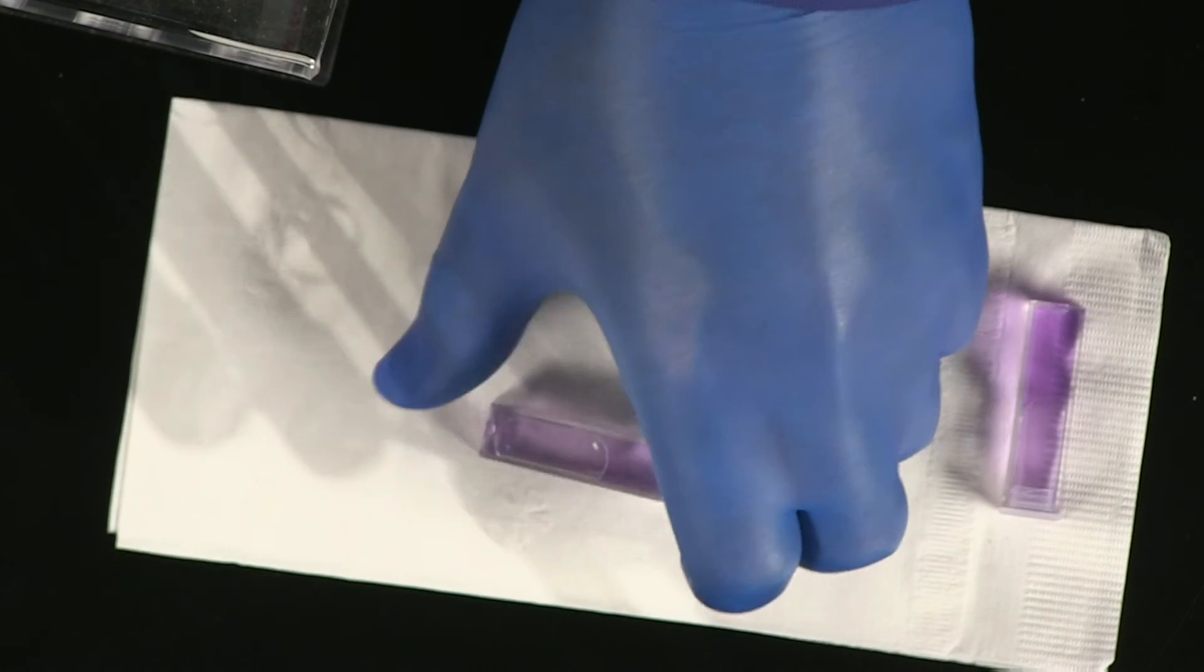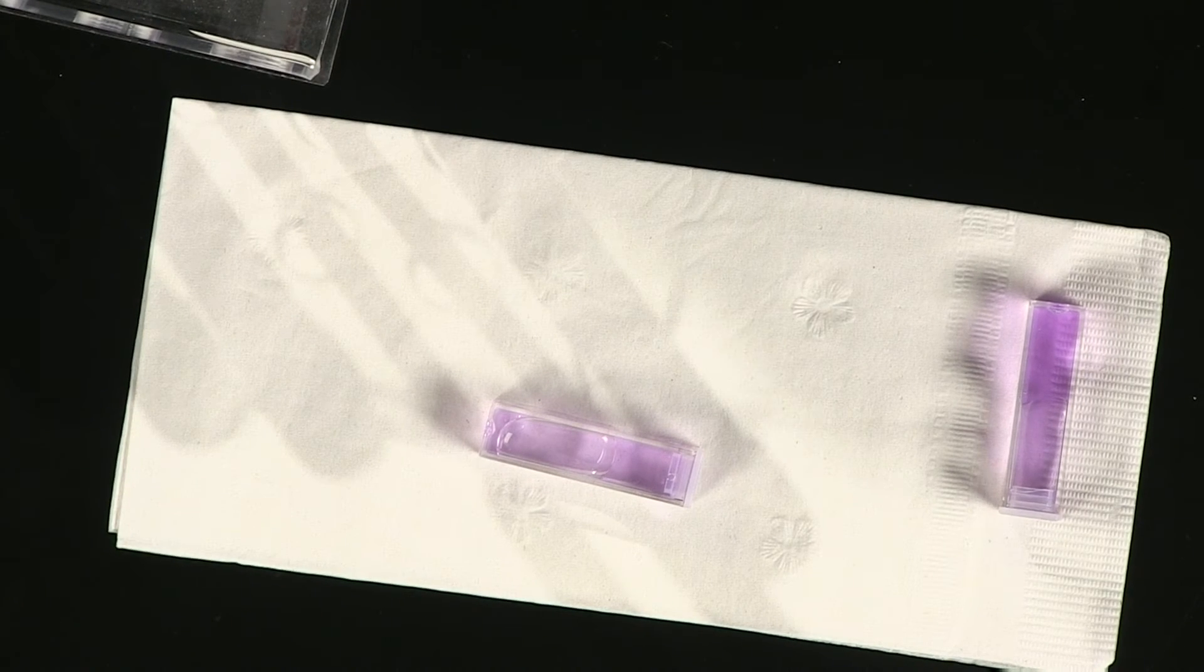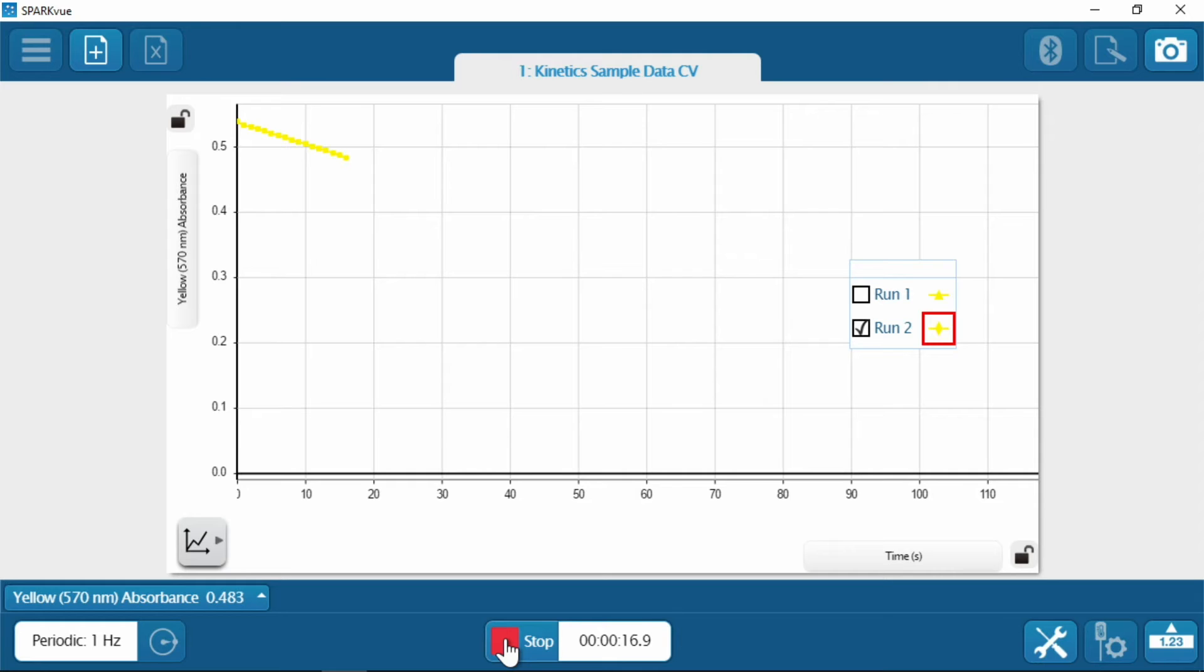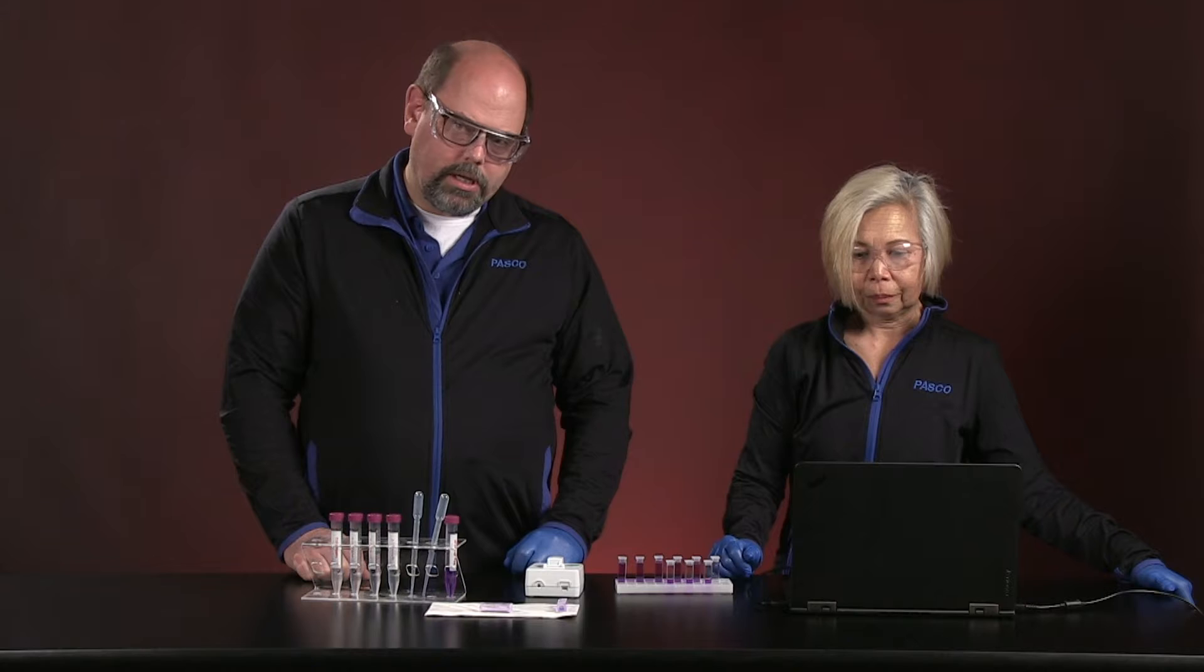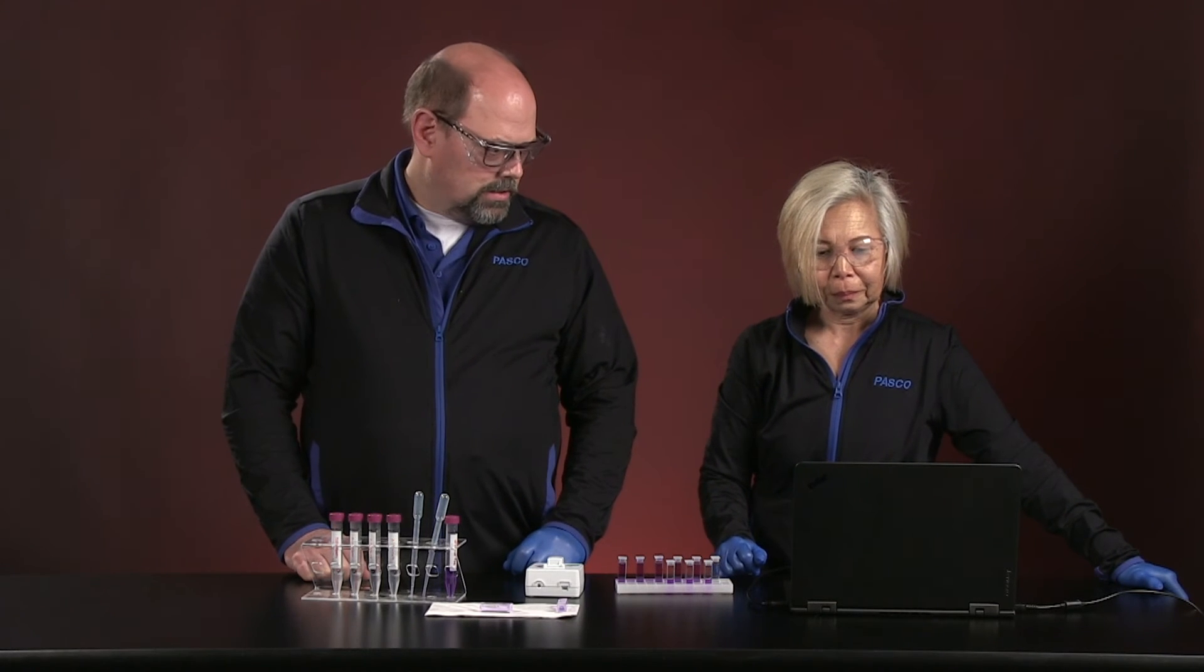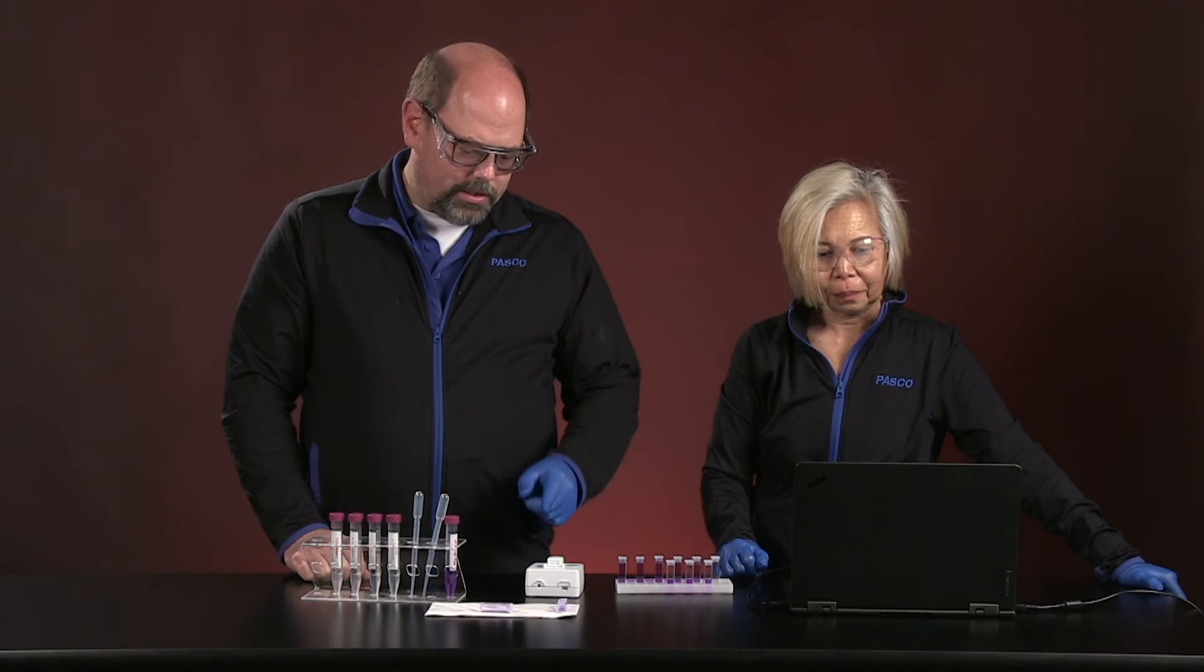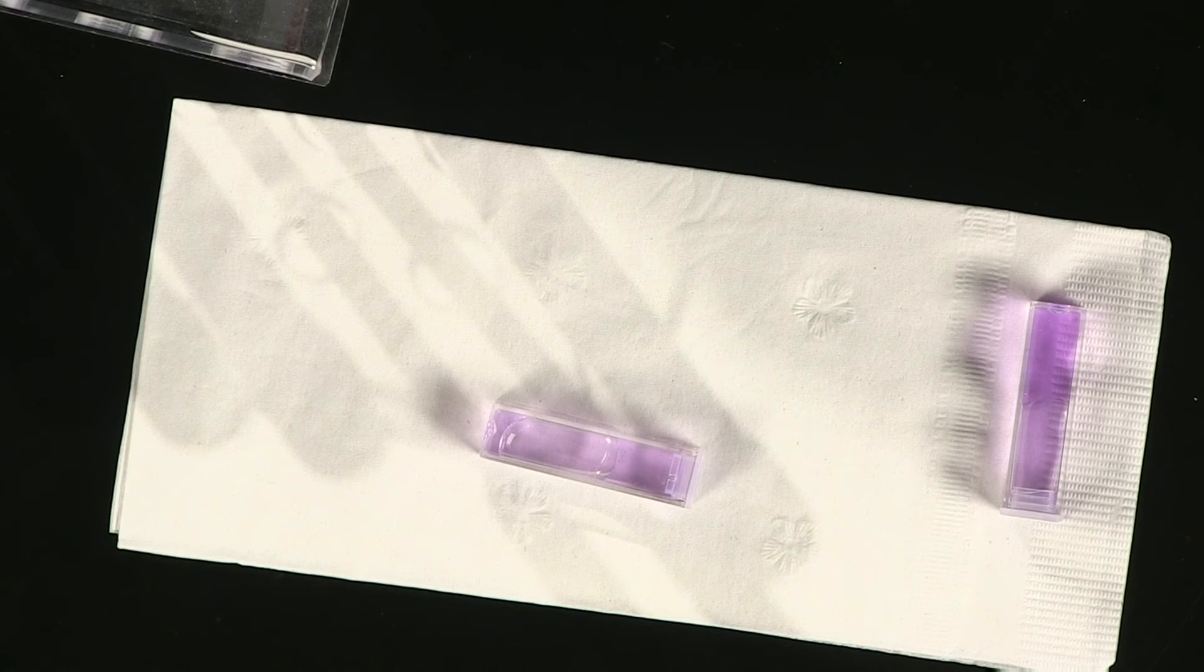So now he's going to add one and a half milliliters of 0.1 molar sodium hydroxide. We'll let that stir just a little. It appears to be getting lighter. I hope the yellow is showing very well. Solutions are purple again because the yellow is being absorbed. And so we're following that yellow absorbance. It's getting less and less yellow absorbed from there. We'll put it next to it on this napkin here in a second.